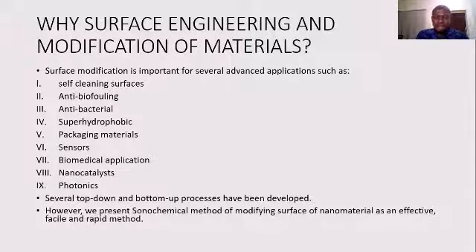However, in literature, there are several top-down or bottom-up processes that have been used in modifying the surface of nanomaterial for the applications I mentioned earlier. But herein, this is the work we want to present, what we've done in the lab of Professor Afzan Abdulaziz at University of Science Malaysia. This work is what we've done between 2013 till date in trying to establish the use of the sonochemical method in modifying the surface of nanomaterial, and not just to modify, but also to show that the sonochemical method is an effective, facile and rapid method of modifying the surface of nanomaterial.